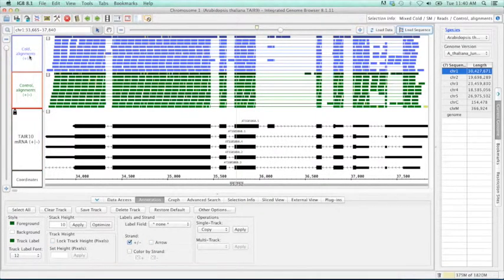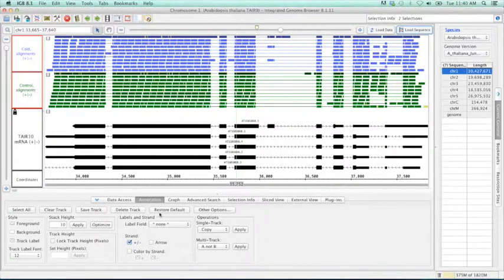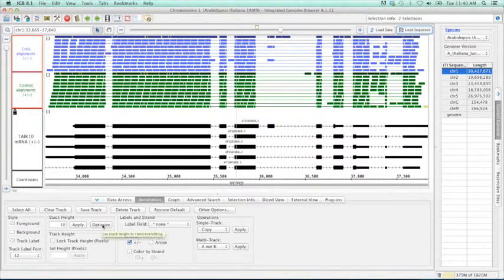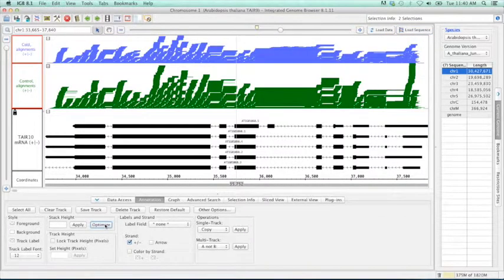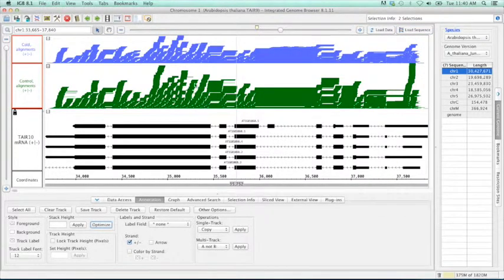Now we can see we have a lot of reads and that we probably have even more reads here. So let's go ahead and just see what this looks like. I'm going to shift click, select both of these tracks, and I'm going to click optimize like I did before for the TAIR10 mRNA, and let's just see what we come up with. There are a lot of reads.